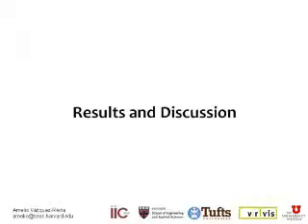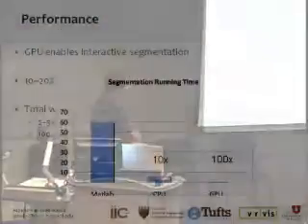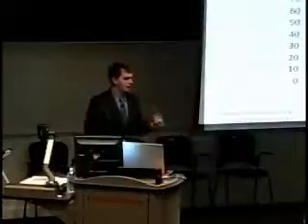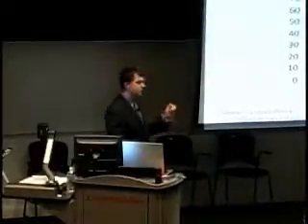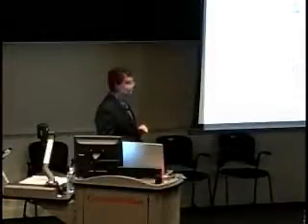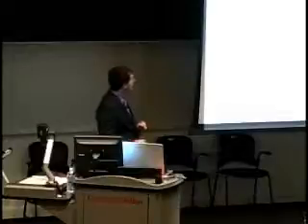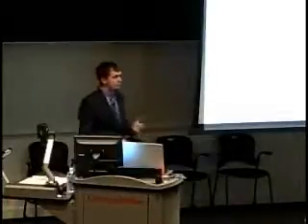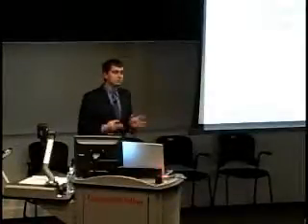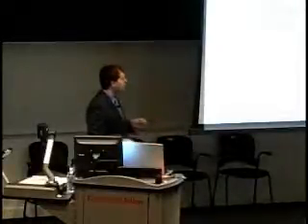So we've seen already the different parts of the workflow of NeuroTrace. Now we can move to the results and the discussion of the project. It is clear that the GPU is what makes NeuroTrace a useful tool. The GPU allows us to do all these fancy computations in real time at interactive rates. Using NeuroTrace, the accuracy of the segmentation is about 80%, so we only require about 10 or 20% of manual edits per axon. This means we can process about 3 slices per second using the GPU on a normal computer, which is equivalent to about 1 millimeter of brain tissue per day.